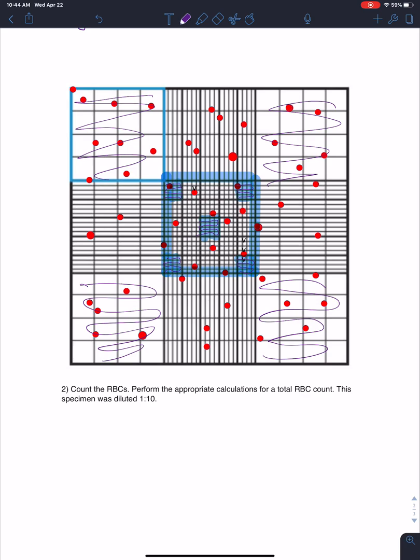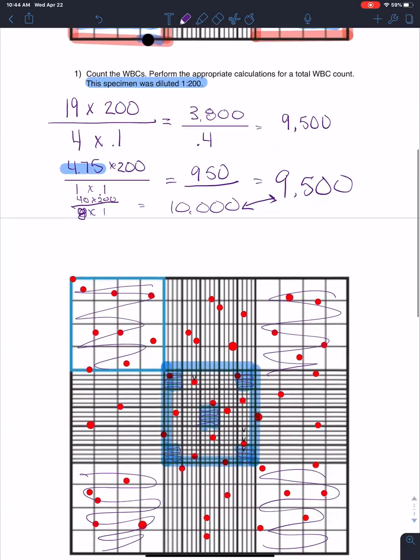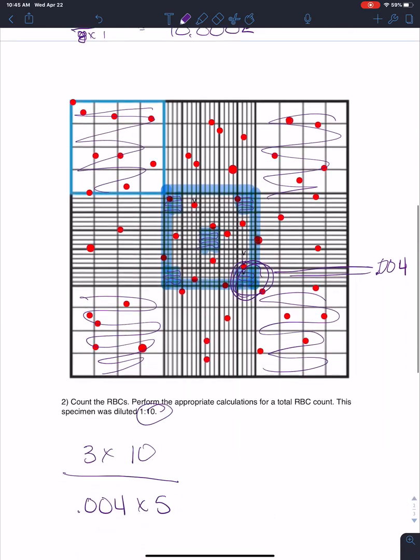So we're going to end up with 1, 2, we're not going to count any in there. We'll go ahead and count this one, 3. So we honestly only have 3. Okay, so we have 3 cells times, let's go back up here, 3 times our dilution factor. In this case, it's 10. We're going to divide by, and see, these boxes are much smaller, so they are 0.004. So 0.004, and we counted 5. I think I wrote this backwards from how I wrote it up here, but okay.